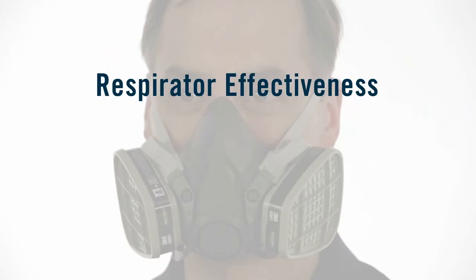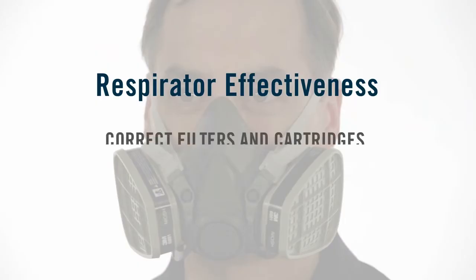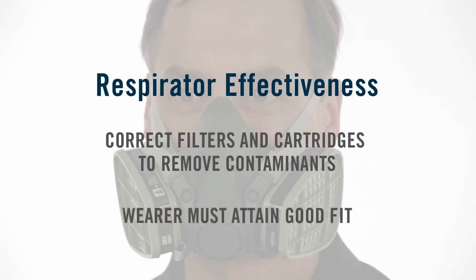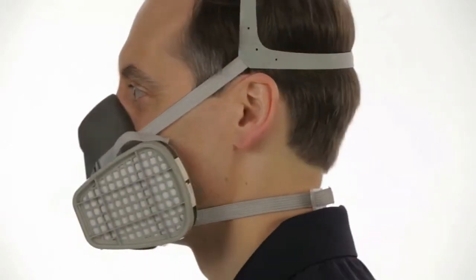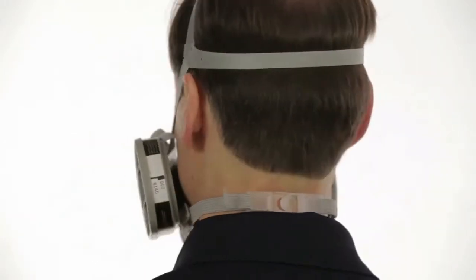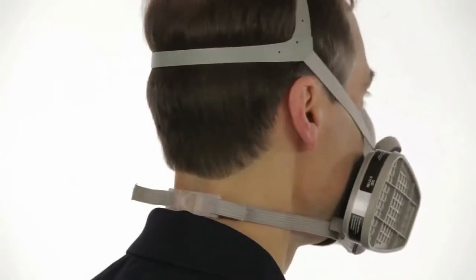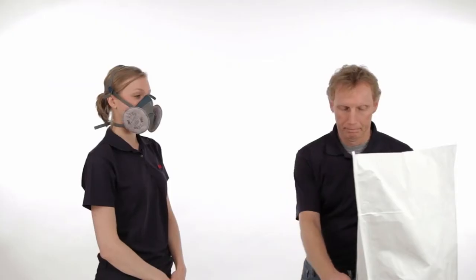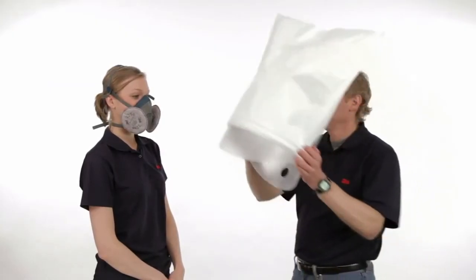The effectiveness of a respirator depends on its filter's efficiency in removing contaminants and the ability of the wearer to achieve an appropriate fit. No respirator can be effective if it doesn't fit and seal properly to your face. It is critical that all edges of the respirator are flush against your face. If you have a beard or other facial hair, or any other condition that interferes with the face seal, you cannot use the facepieces featured in this video. An additional segment demonstrates fit testing your respirator.